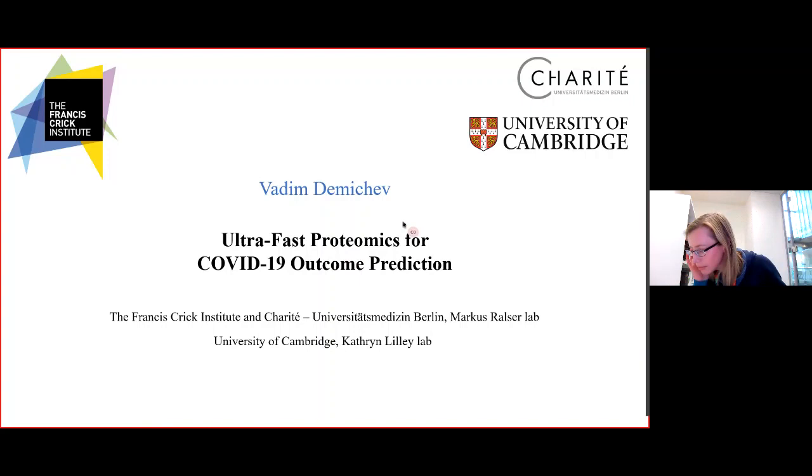Thank you. Yes, thank you so much for the introduction and many thanks to the organizers for inviting me. I will briefly introduce our ultrafast proteomics platform first, and then talk about how we use it to profile plasma and serum samples from coronavirus patients to understand the progression of the disease and eventually to predict the outcome.